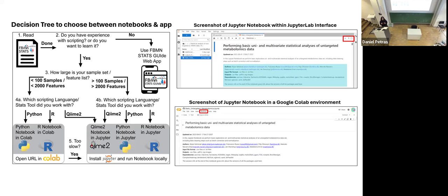Cool. Just to introduce a little bit about Jupyter Notebook, because I'm talking a lot about it. Basically, it has these code cells and markdown cells, which is easier for somebody to share, the same as a Google Doc, where you have this information in these markdown cells, or text cells, and you also have these code cells, which perform a few lines of code, and you can see the outputs right after the code cells, which is easier to interpret.